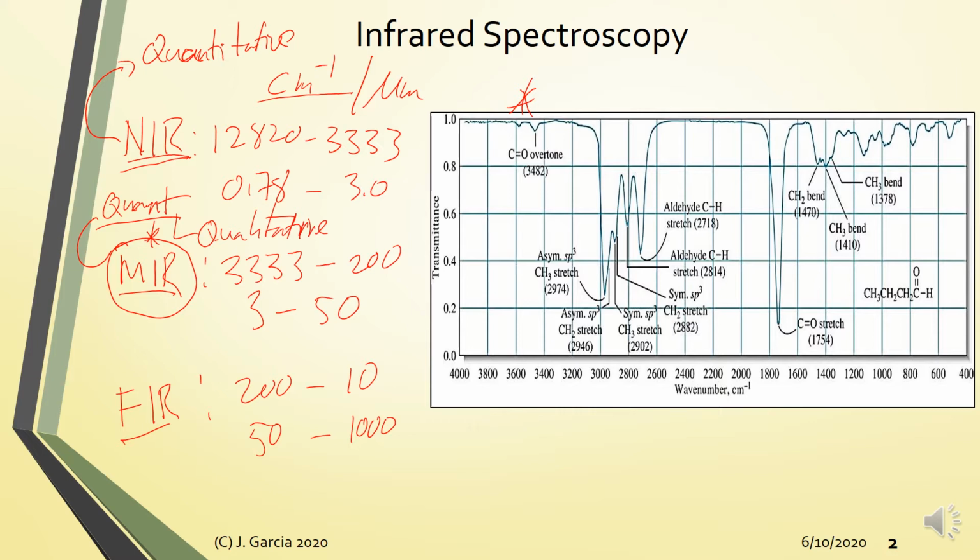So that's the power of MIR. As you've experienced in the laboratory, basically every analyte would generate a somehow unique mid IR spectra, such as what is presented here.